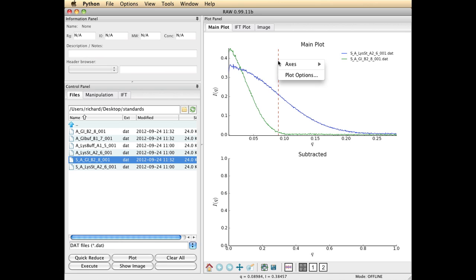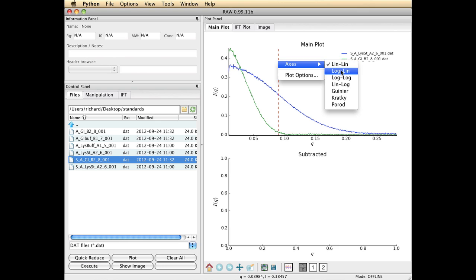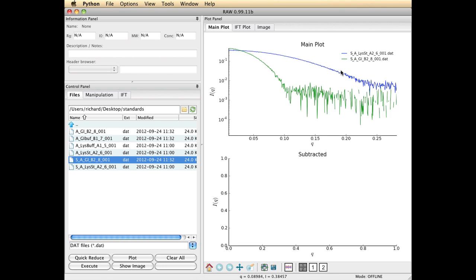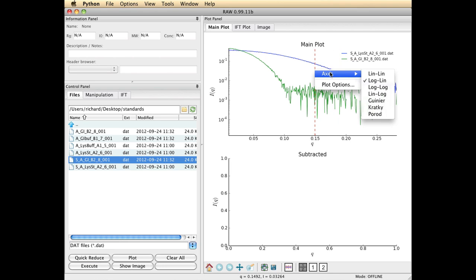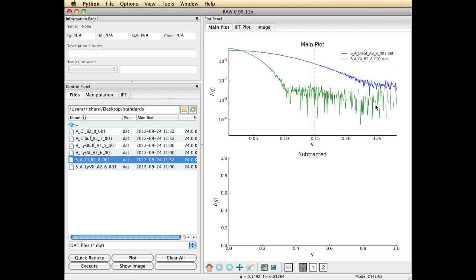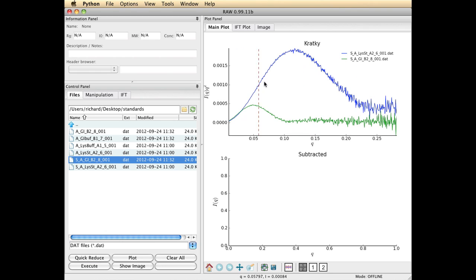If you click your right mouse button, you'll see a little menu pop up that allows you to choose different types of plots. The log-lin plot is very popular and so is the Kratky plot. Kratky plot shows you whether or not something is folded.